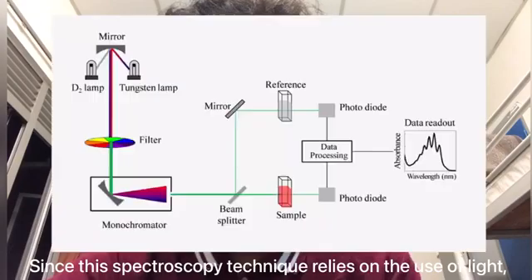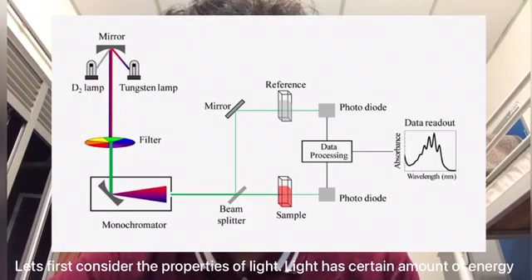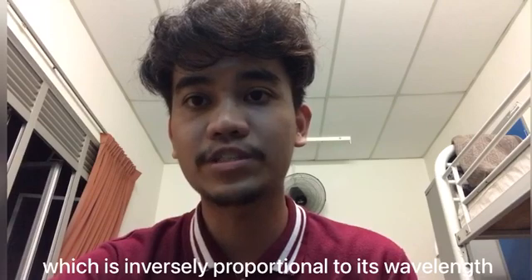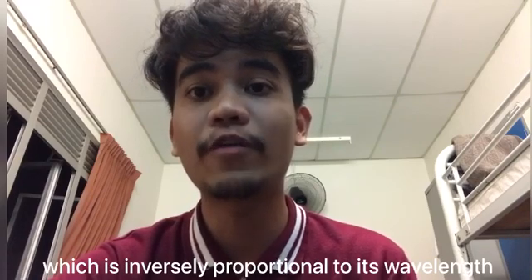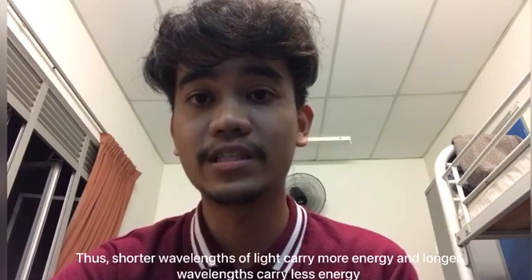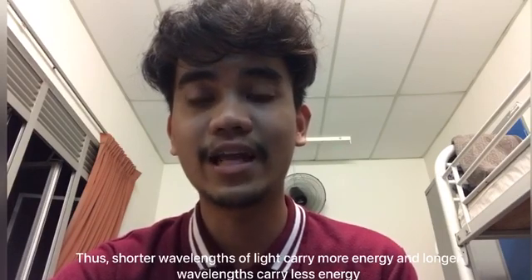Since this spectroscopy technique relies on the use of light, let's first consider the properties of light. Light has a certain amount of energy which is inversely proportional to its wavelength. Thus, shorter wavelengths of light carry more energy and longer wavelengths carry less energy.